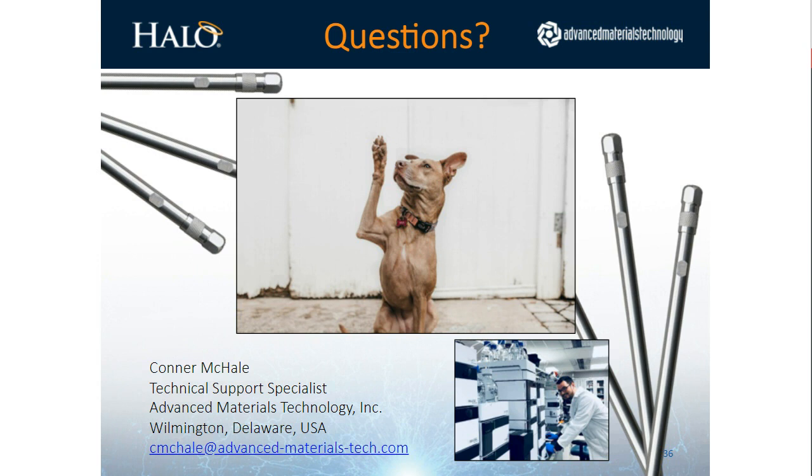We'll run a series of tests here in our lab to confirm that there is an issue, and we'll see a divot in the column and literally losing silica, and there's really no way other than repacking the column to fix that.